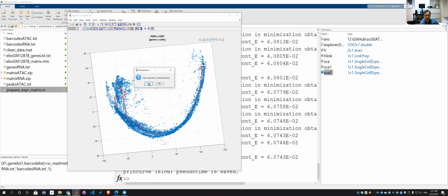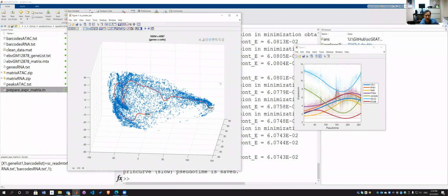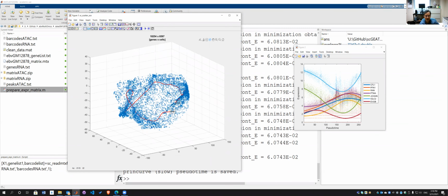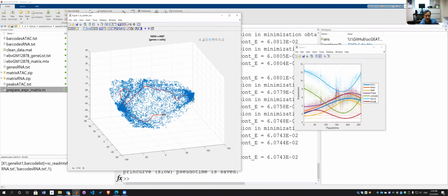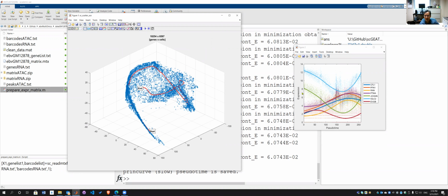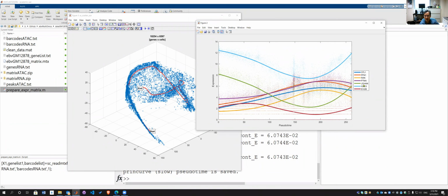It asks me whether to show the expression of selected genes. Okay, yes. Well, this time the pattern is more complicated because this algorithm will follow so vigorously along this trajectory and introduce a very complex trajectory. But maybe this is overcomplicated. And the genes selected as examples are those blue one, still this, the green one, see there are some other genes that have been selected.